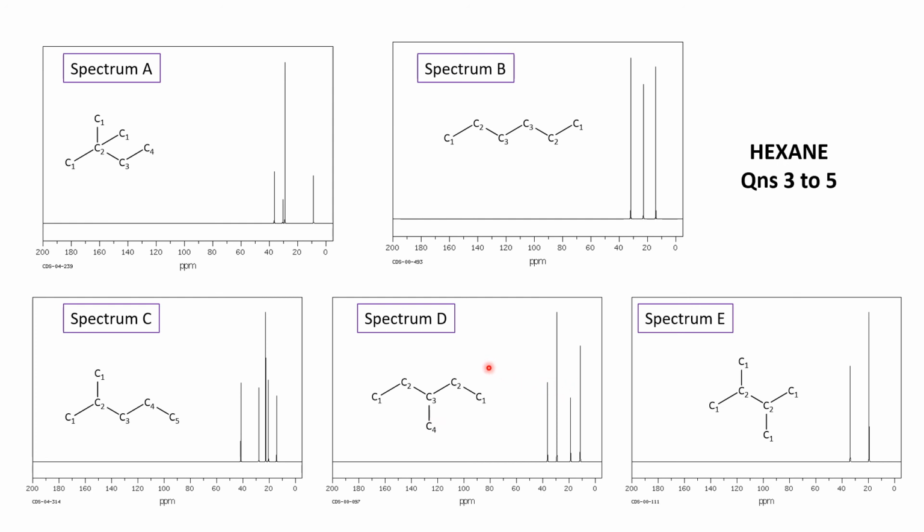But knowing that I had to somehow distinguish between this molecule and this molecule over these 2 spectra, I would say this spectrum is much more likely to belong to the molecule that's got a distinct imbalance of the numbers of carbons, 3 carbon 1s to 1 to 1 to 1, and this one would go to one that's a little bit more representative, 2 carbon 1s, 2 carbon 2s, carbon 3, and a carbon 4. As I say, do not go and have a bet with an NMR spectroscopist about that, but when all other things are equal, you can get some teeny little inference from the peak heights.